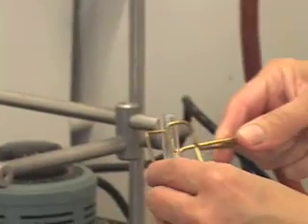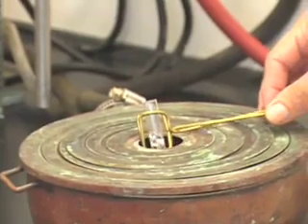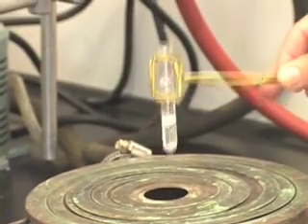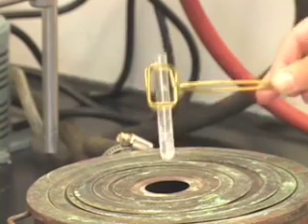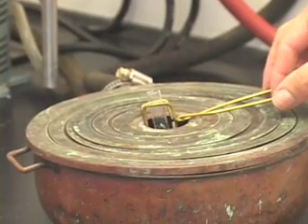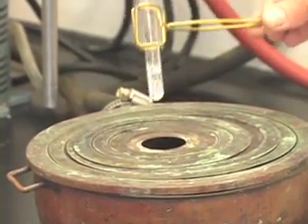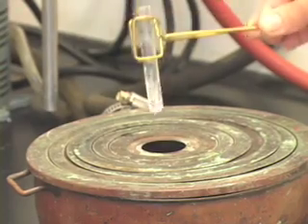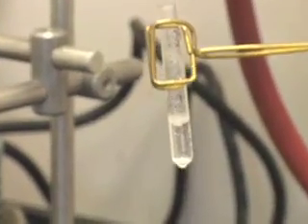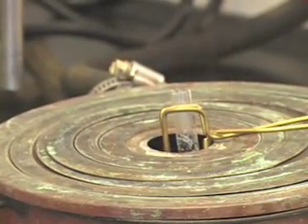Use a test tube holder, hold the test tube, and keep it in the steam bath. Every once in a while, remove the test tube and shake it well. It seems like some of the solid has dissolved, so we will continue to heat for a little longer to see if all of the solid will dissolve or not.